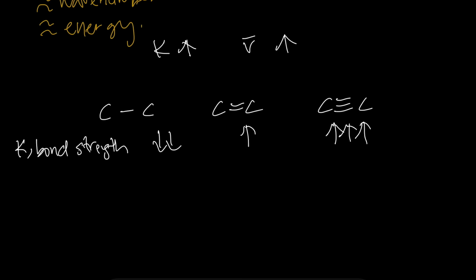By using Hooke's law, we know that when the force constant or bond strength increases, the wave number also increases. So the relation is directly proportional.